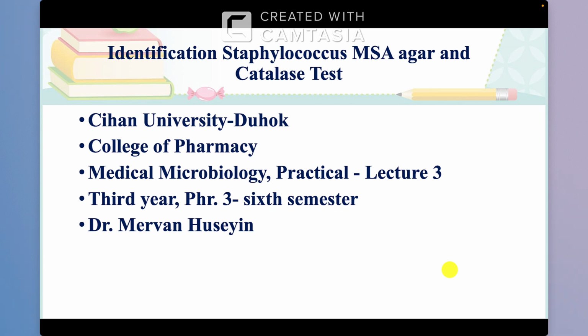Today, our practical lecture is Identification of Staphylococcus on MSA agar as a selective media and by catalase test.